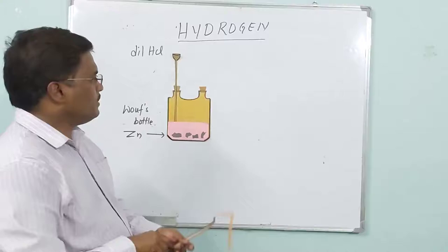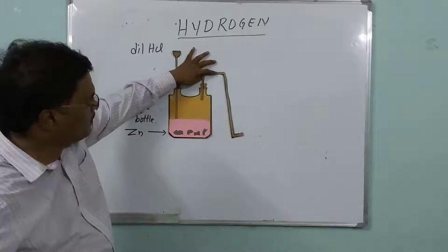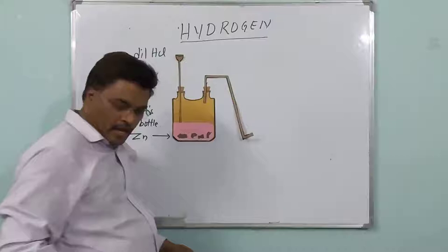Then through this side, you have to arrange the delivery tube. This long tube is called the delivery tube. You arrange the delivery tube like this, through this side.